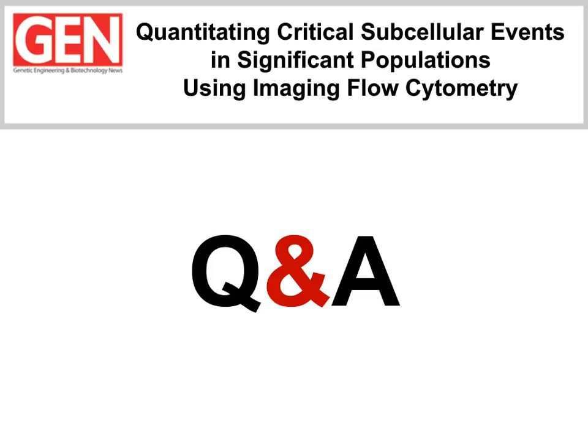All righty, thank you very much, Olivier. And it looks like we have time for one more question for Chris. Chris, when you prepare your cells for imaging flow cytometry, can you use the same protocols for classical non-imaging flow?